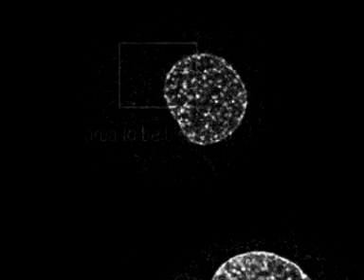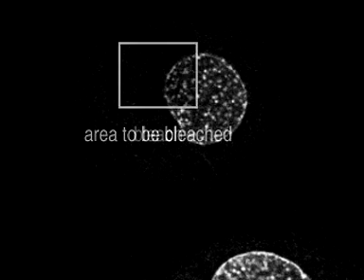The same experiment can be repeated using a protein that is firmly anchored and not free to diffuse.